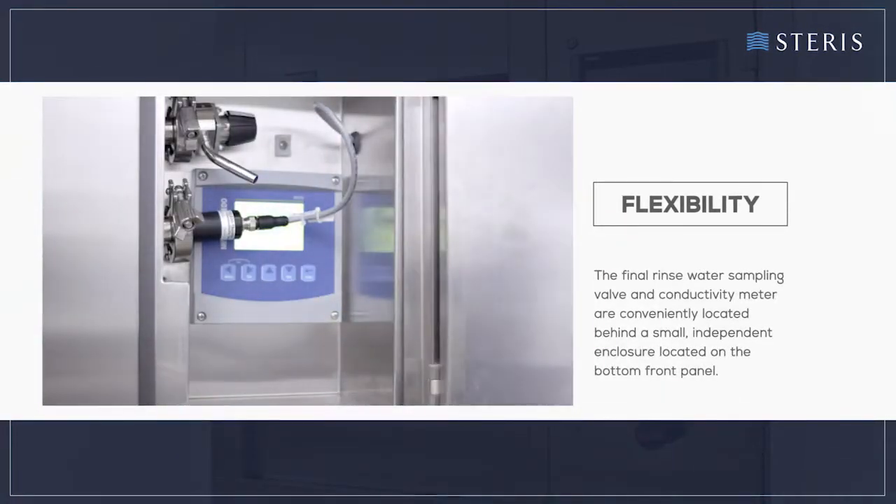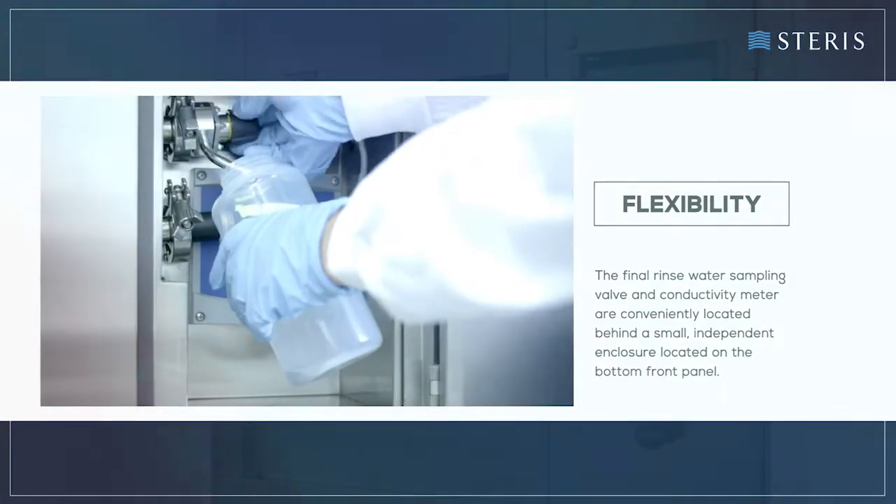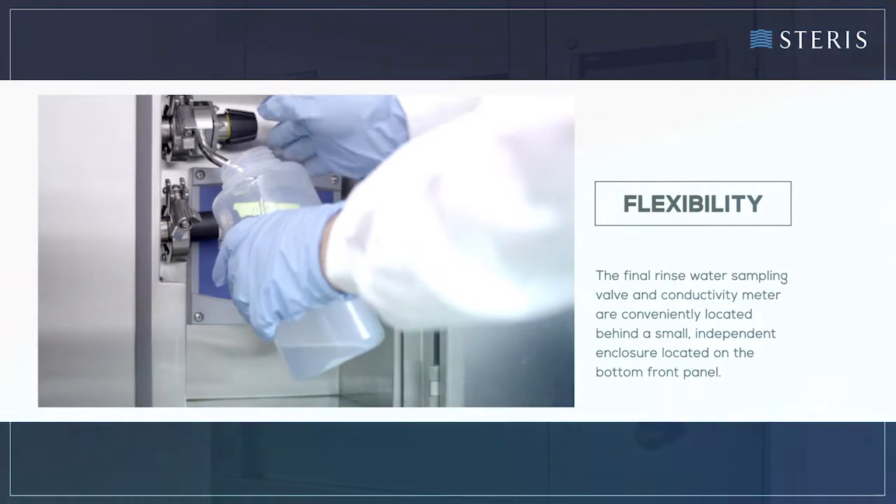The final rinse water sampling valve and conductivity meter are conveniently located behind a small, independent enclosure located on the bottom front panel.